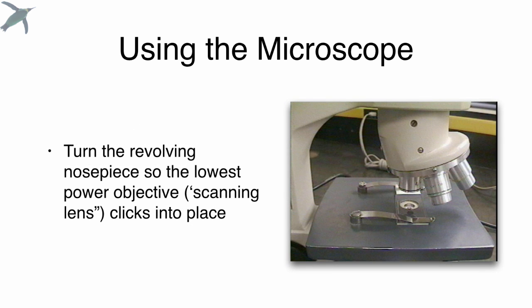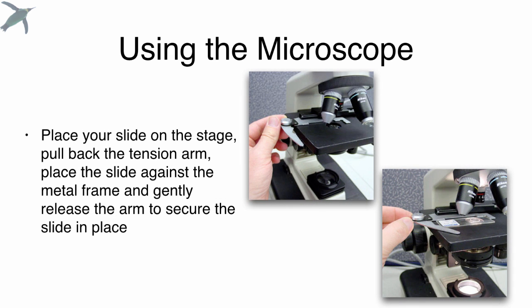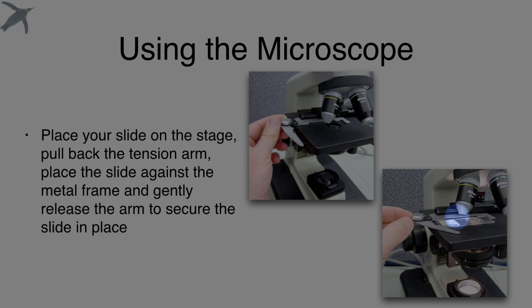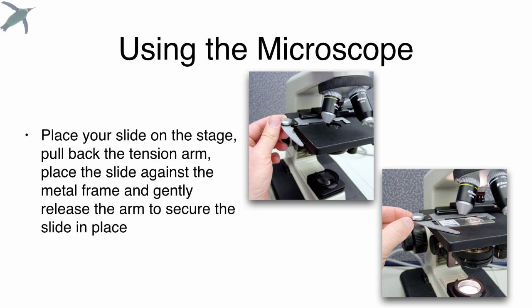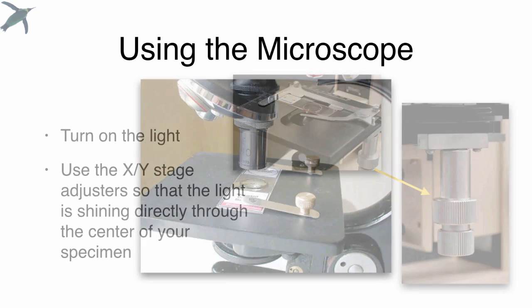You want to turn the revolving nose piece so that the lowest power objective, we call that the scanning lens, it has the smallest number on it and it is the shortest. You want to click that little guy into place, put your slide on the stage, and if you have a tension arm, you want to pull that back. There's a little frame in there that helps to hold the slide, and then the tension arm keeps it from moving around. Now you can use those coaxial controls to very smoothly move the slide and adjust it so that the light is shining directly through the center.